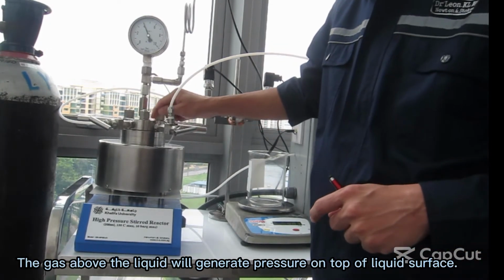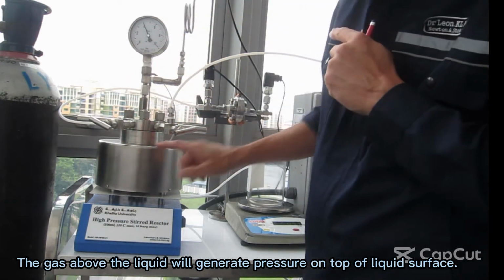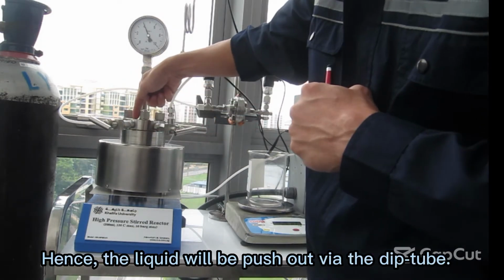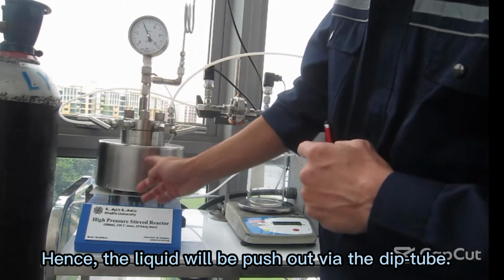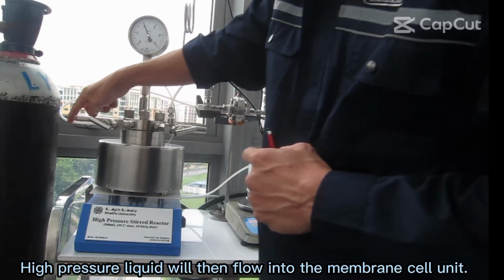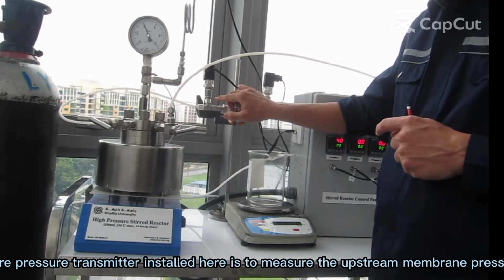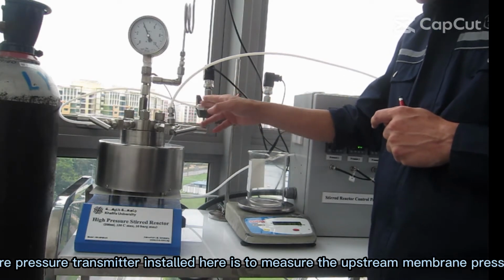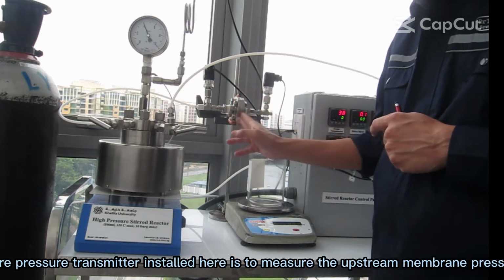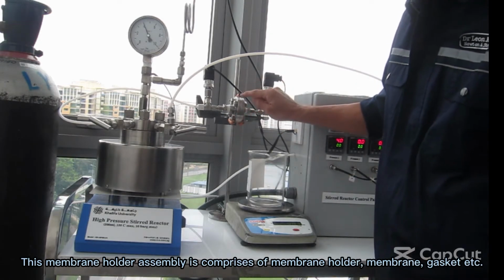The gas above the liquid will generate pressure on top of the liquid surface. Hence, the liquid will be pushed out via the dip tube. High-pressure liquid will then flow into the membrane cell unit. The pressure transmitter installed here is to measure the upstream membrane pressure. This membrane holder assembly comprises the membrane holder, membrane, gasket, etc.